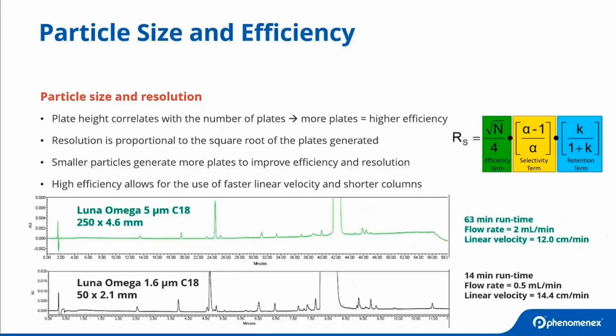And so now we start running into, well, once we've increased that resolution, we have more resolution than we really need, we can afford to shorten the column so as to return to our original level of resolution while also achieving a much shorter run time.